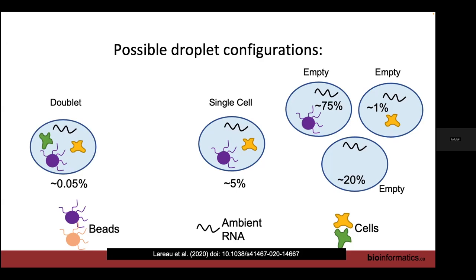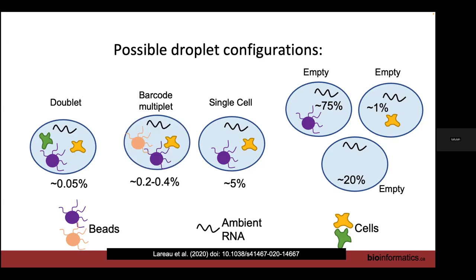About 20% of droplets have only ambient RNA and nothing else, and 75% of the time we have a barcoded bead with ambient RNA, meaning that bead can capture ambient RNA and generate cDNAs that end up in our sequencing data. We can also get doublets — one droplet with two cells and one barcoded bead. Less common is a barcode multiplet, where one droplet has two barcoded beads and one cell, which is actually more common than doublets. In the sequencing data you can't tell a barcode multiplet apart from having two cells.